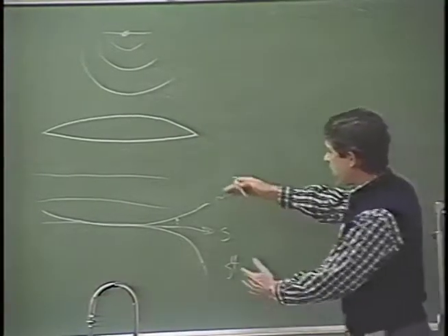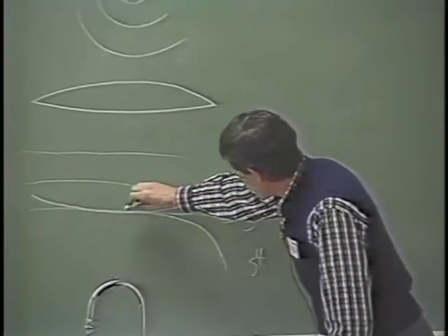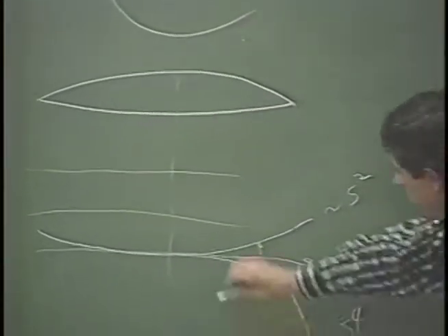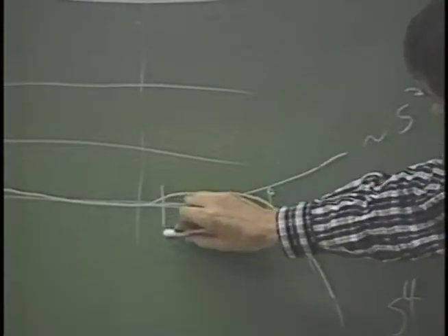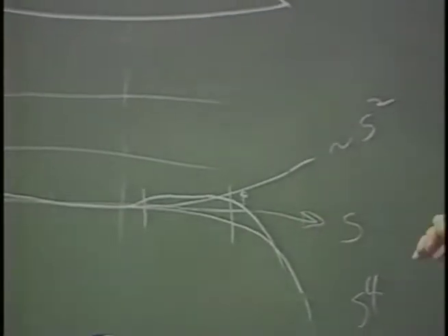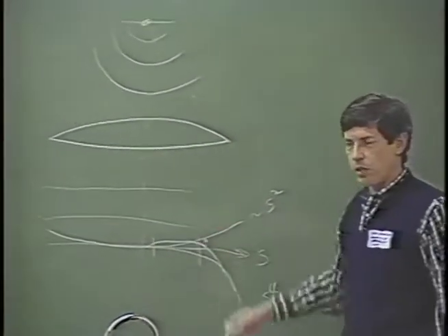And it's possible to play these two off against each other, the defocus and the spherical aberration, so that over, if I draw some optical axis in here, over some good range of spatial frequencies, you get a phase shift that's about the additional quarter wavelength that you need to get the phase contrast imaging with a half wavelength phase shift total.